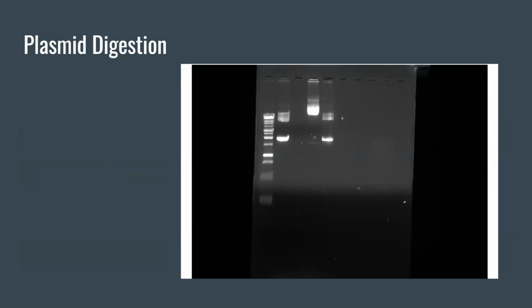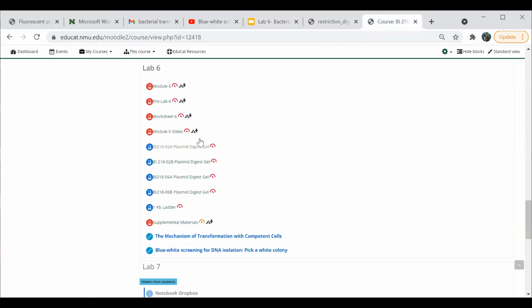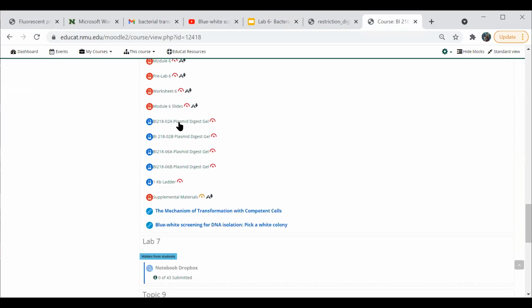Now I'm going to go onto the EDUCAT page, and I'm going to show you some of the resources that are available there. So here we have Module 6 posted and the pre-lab. Again, download these, read through them. Same with the worksheet, and complete them before your next in-person lab period. Then we have a series of 4 plasmid digest gels. You can pick any one of them and include it in your notebook and use it for your analysis.